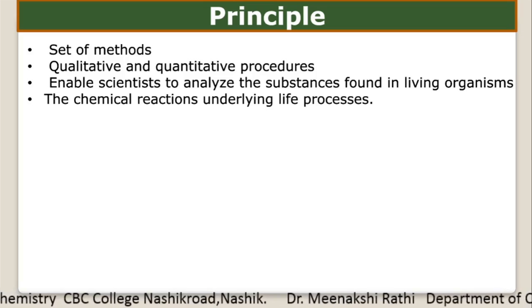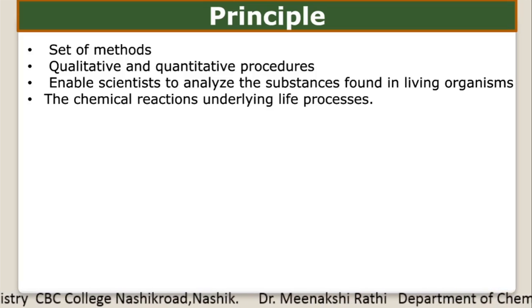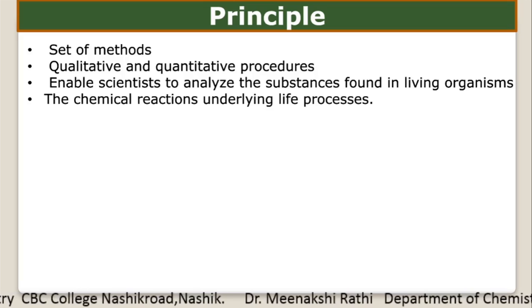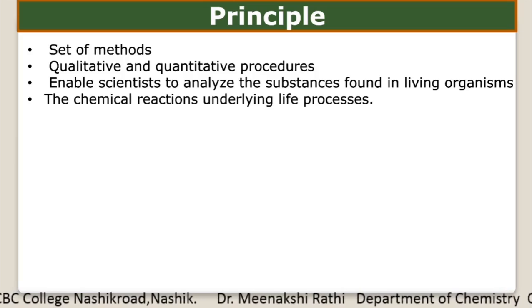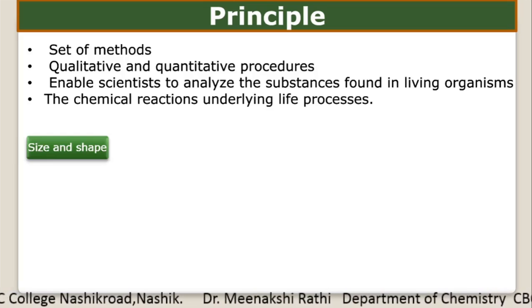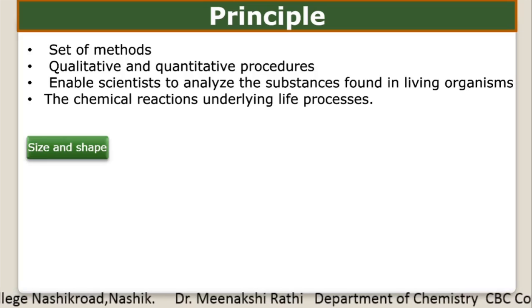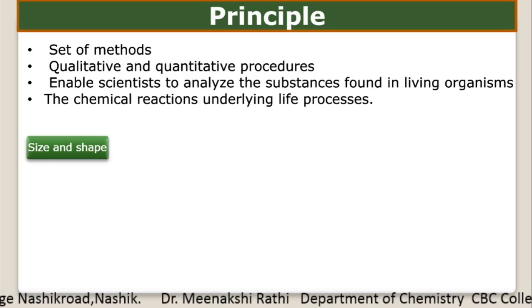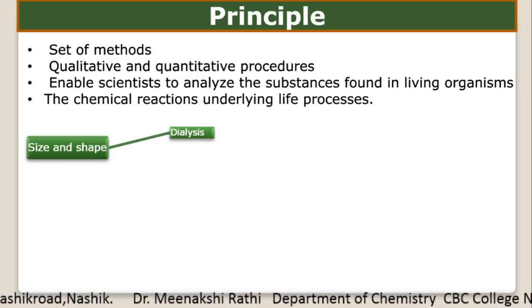In the same way, for biomolecules also, the process of cleaning depends mainly on three factors. The first one is the size and shape of the biomolecule. There are two methods used to purify the biomolecules based on size and shape.